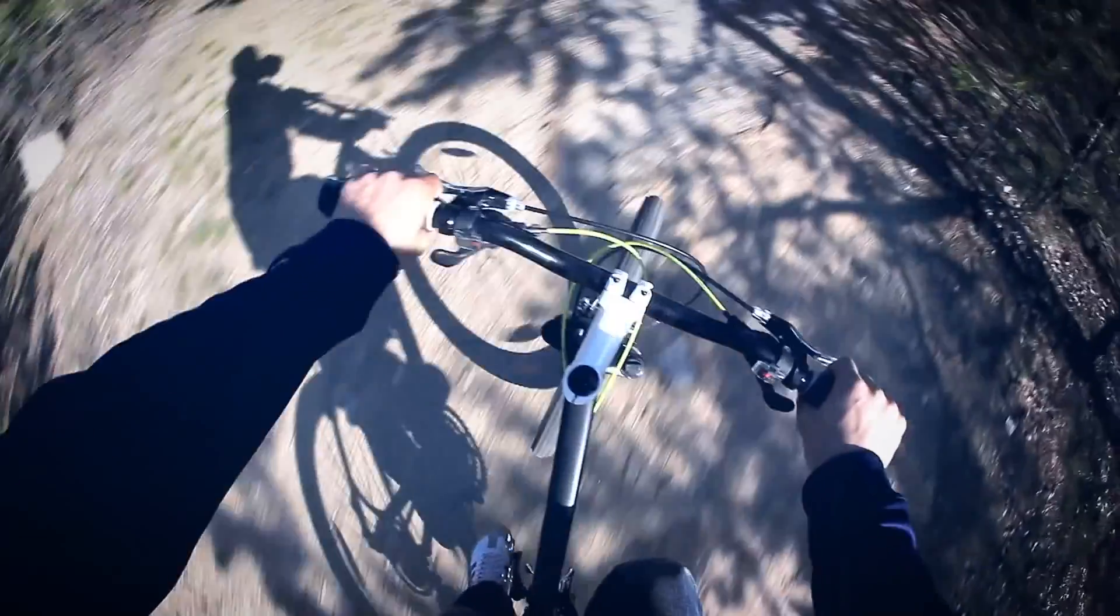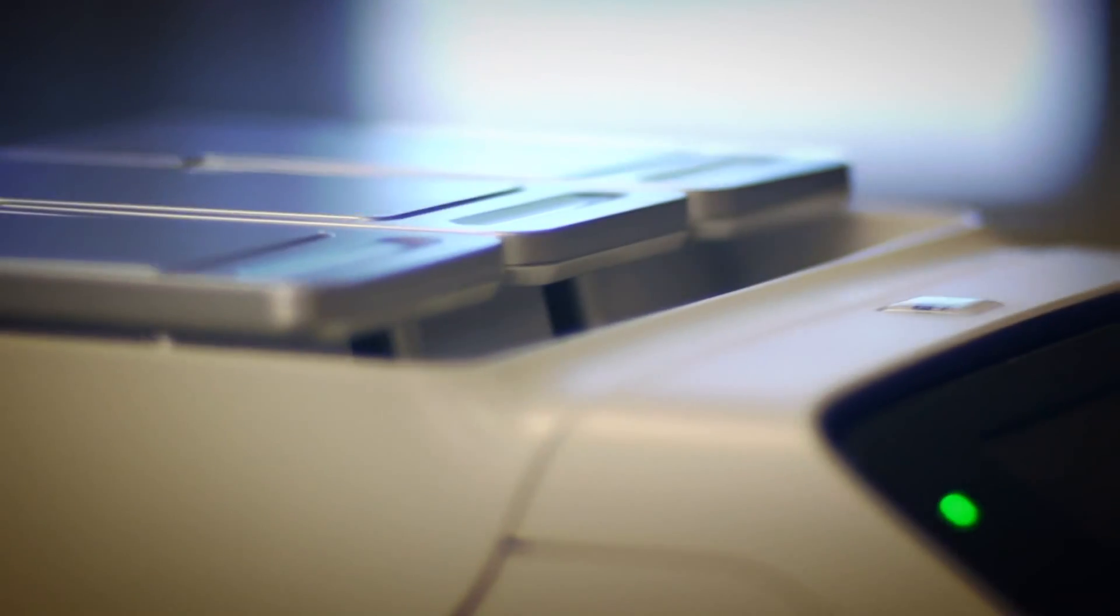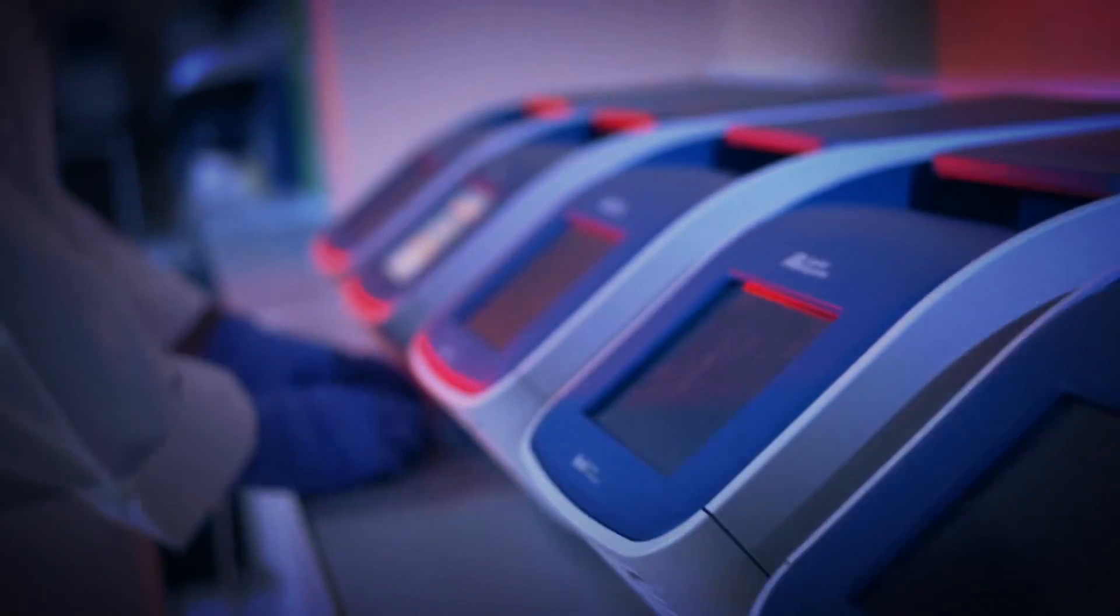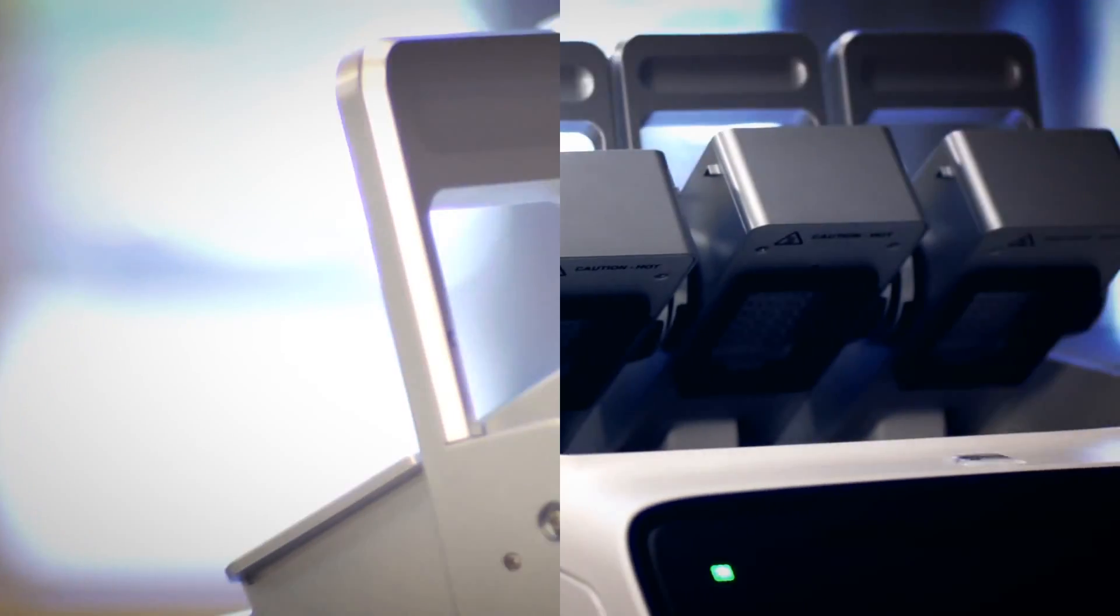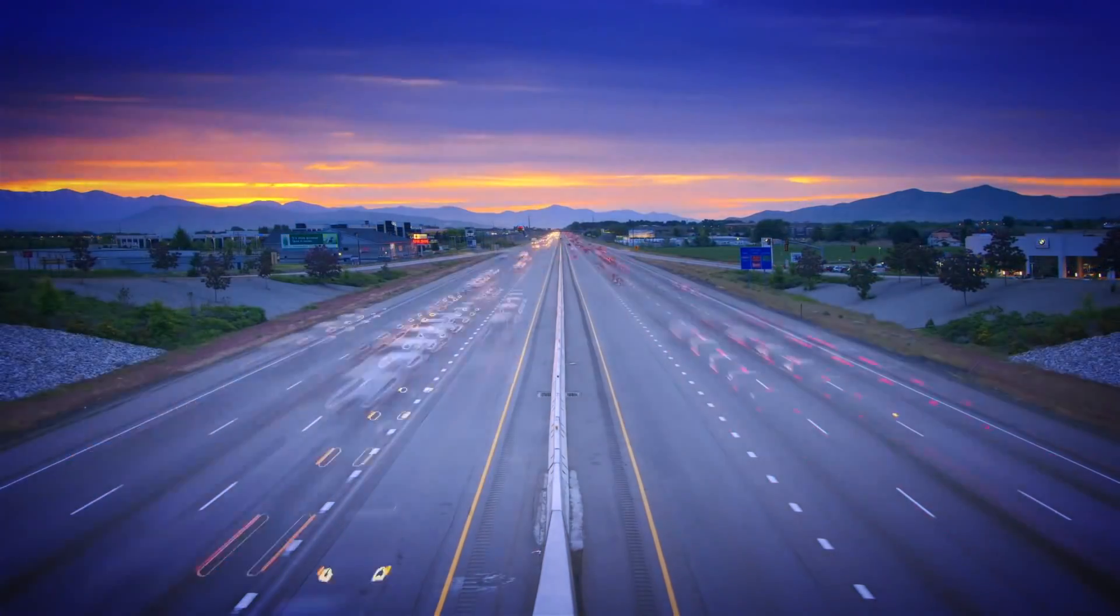But what if we had control? No more mystery box, but a trusted bench with tools that would deliver. And what if that bench could do more than just work? What if it could actually make your life easier? What if you could do your science when you needed to because your instrument could increase capacity to more than one user? Like a highway that can keep moving because it can increase from one to two to three lanes as other cars join.